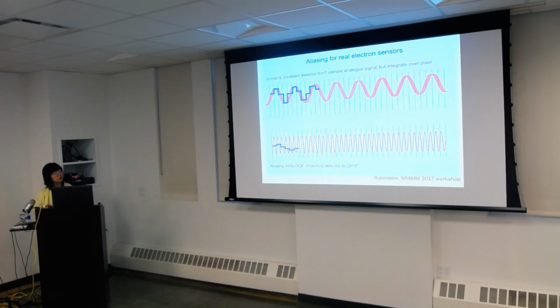All right, there's another kind of aliasing that Grant actually covered. He was saying that in reality, when we are reading the information of our Fourier things, we are actually doing it in a discrete way. The pixel is picking up an integration of the values inside that pixel. So its description of that wave is never perfect. Okay? So that's exactly what this slide is trying to show you.